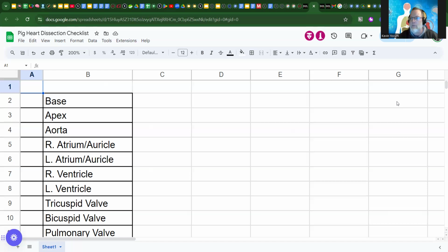You each don't have your own pluck. And then what else? Oh, the GI tract. I'll pull that up in a second. There's just a couple of features for that as well. Same with the kidneys. There's just a couple of items that we look at, literally like three or four.